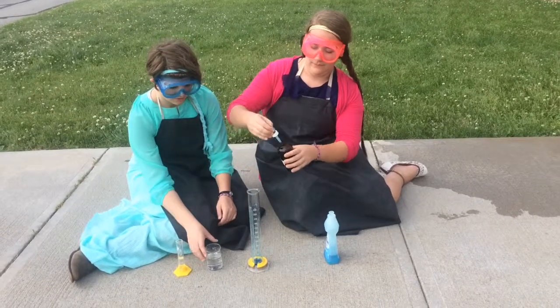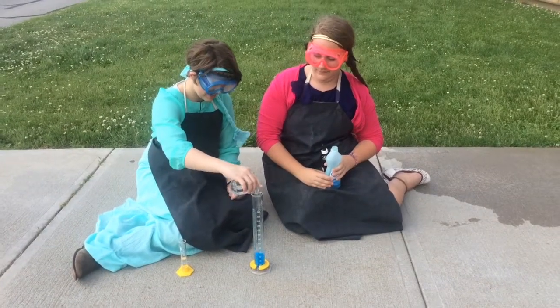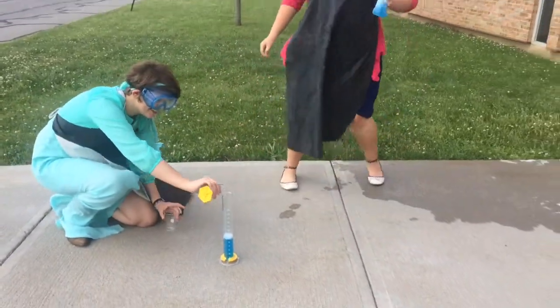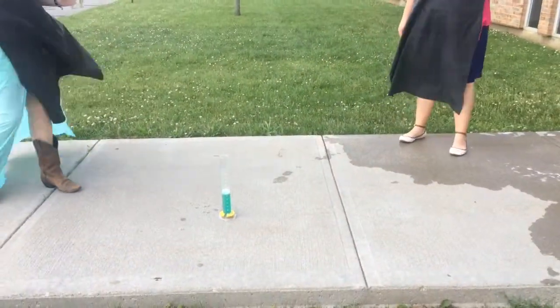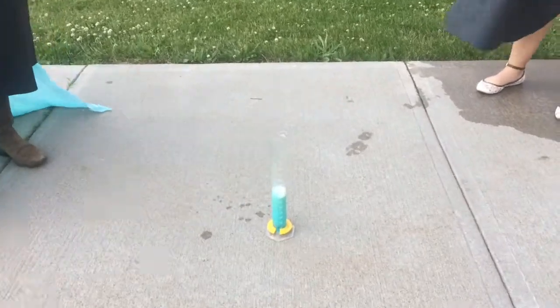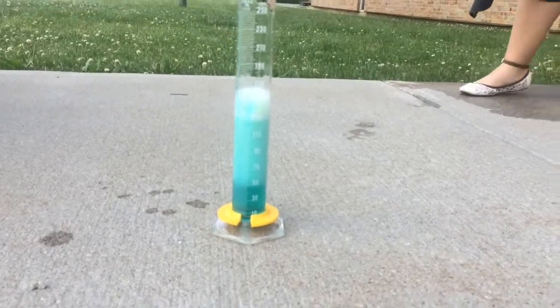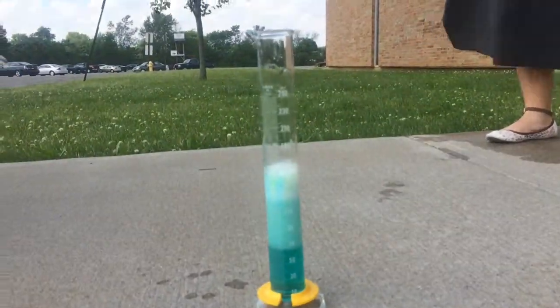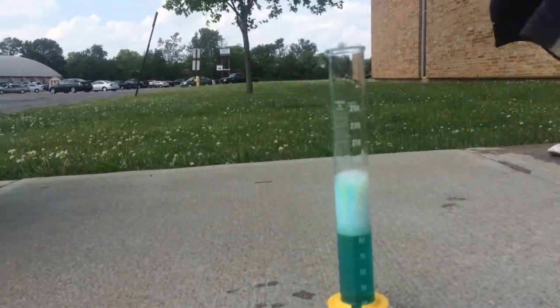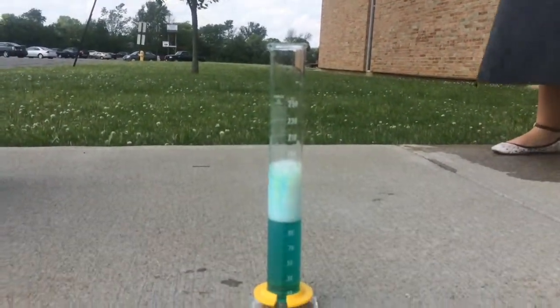We are now going to conduct one final potassium iodide test. As you can see, once again it reacts very slowly. It can do it. Oh, here it goes. It's moving quickly. Alright, so that's that one.